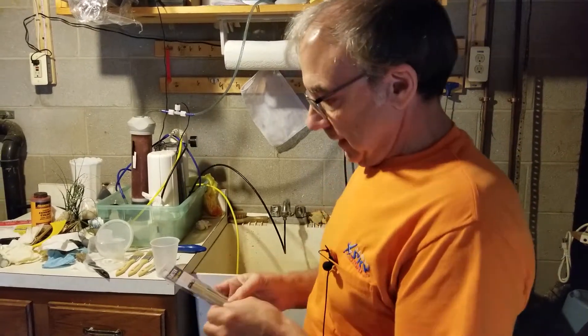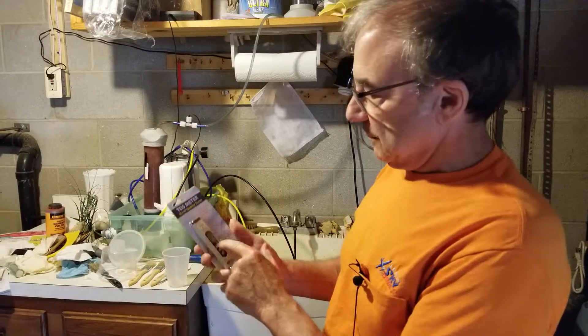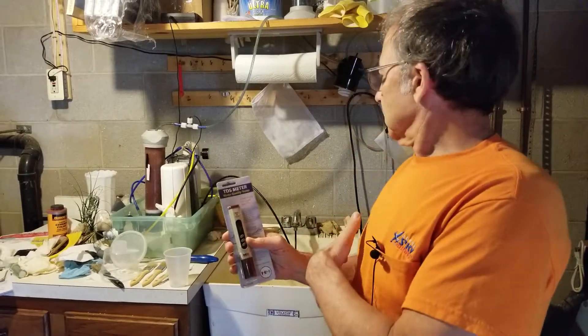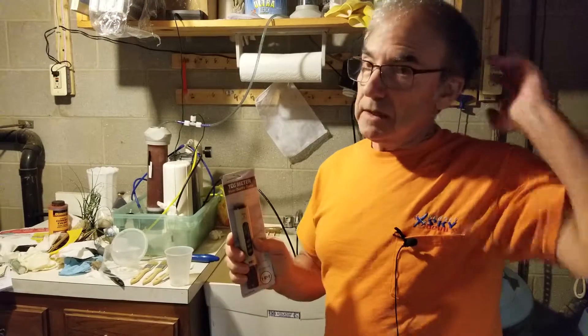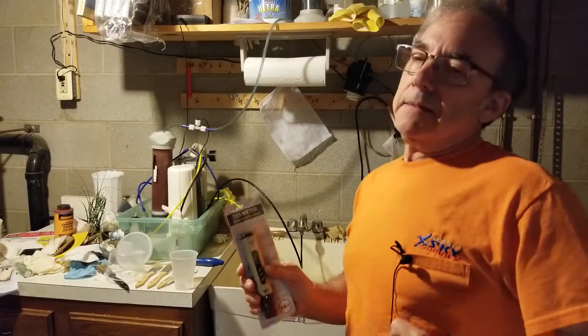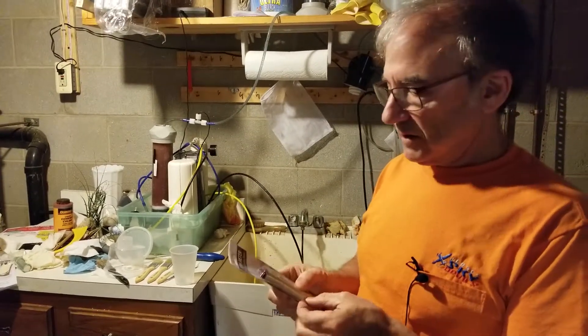This thing has a lot of features. It's got a built-in thermometer if you want to measure the temperature of the water. It will automatically compensate for the temperature of the water when calculating the total dissolved solids concentration, so you don't have to worry about that. That's automatic, but if you want to know the temperature you press a button and it converts to a thermometer.